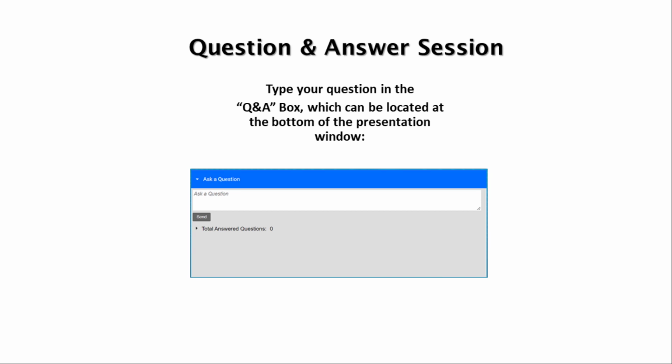Excellent. And next question here. The audience asks, if the L to DP ratio has not been met, but the plates have been met, does this mean you can run this column method without revalidation? Yes, that's correct. So the really nice part about the USP guidance is that you have the option of either meeting the criteria for that L to DP ratio or for the plates in terms of isocratic methods, or the ratio of the retention time to the peak width squared for gradient methods. So you wouldn't have to revalidate, you just have to verify.